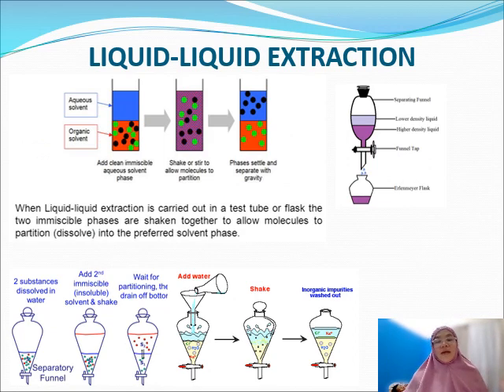Okay, and the third type of extraction. Earlier, the first was distillation. Second is the SOXHLET. Third is the liquid extraction. These three are the common types of extraction applied in our research.